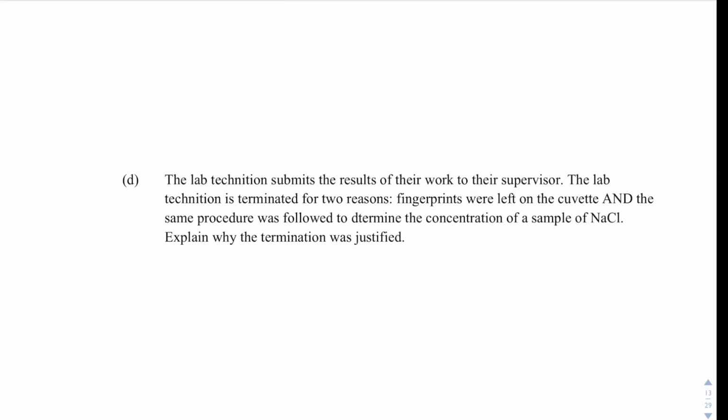Sodium chloride cannot be used for spectrophotometry. Think about what color salt water is. If I was on a boat in the ocean and I took a glass and I got a glass filled with salt water, it would be clear. So we need colored solutions for spectrophotometry.